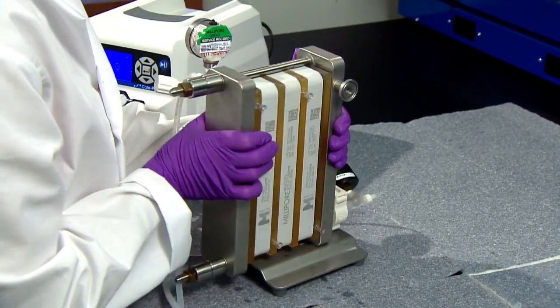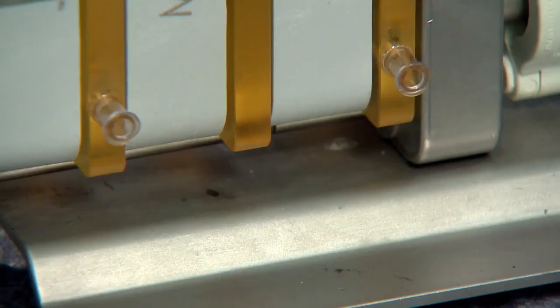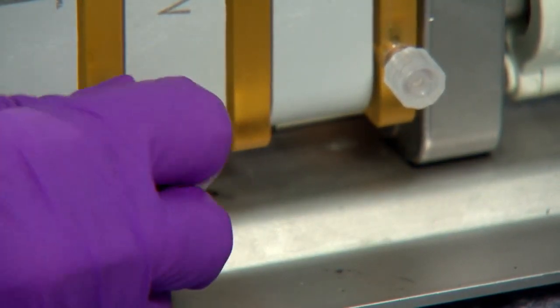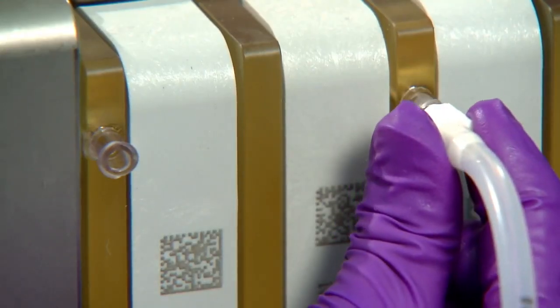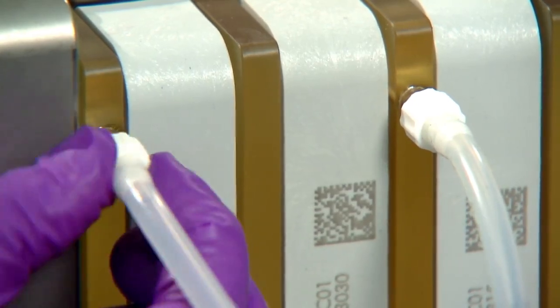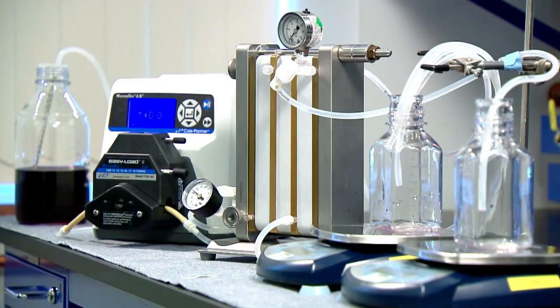Turning the holder around, you will do as you had for the front by capping off the retentate ports, now located at the bottom, and connecting permeate collection tubes to each permeate line. Complete your setup by connecting to your feed and pump with feed pressure gauge to your assembly. You are now ready to run.